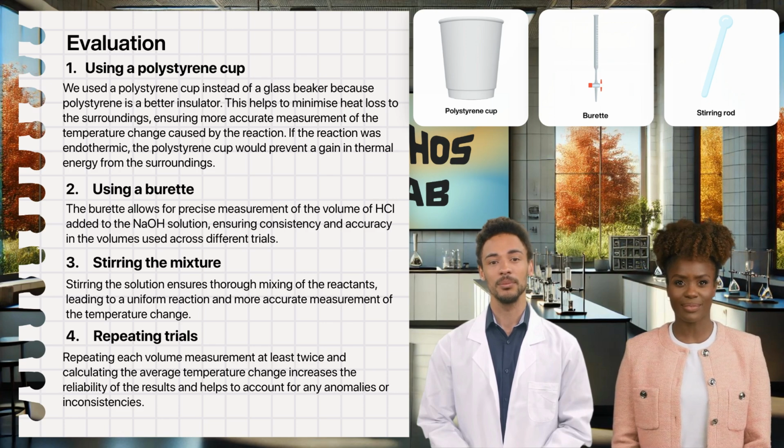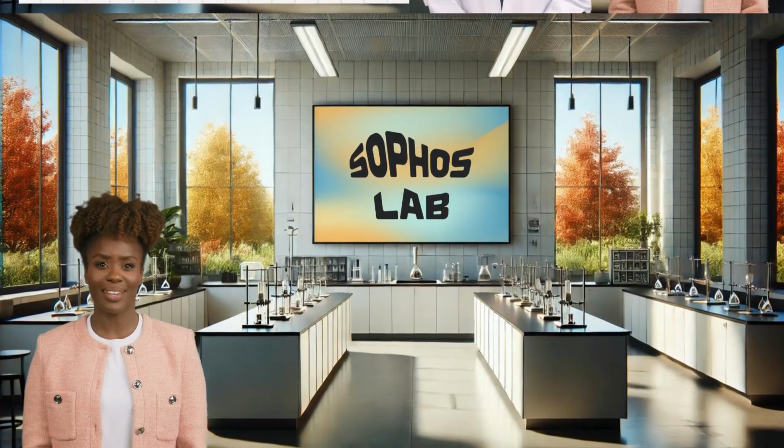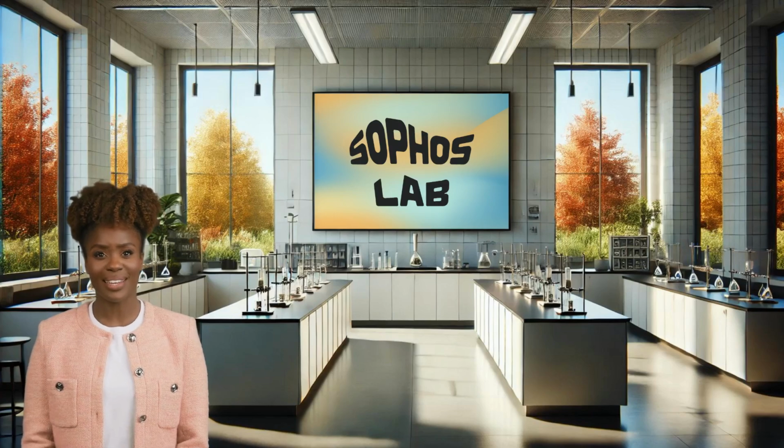Great work! By using a polystyrene cup, a burette, stirring the mixture, and repeating trials, we ensured the accuracy and reliability of our experiment. That's the end of our lesson today. Let's recap.